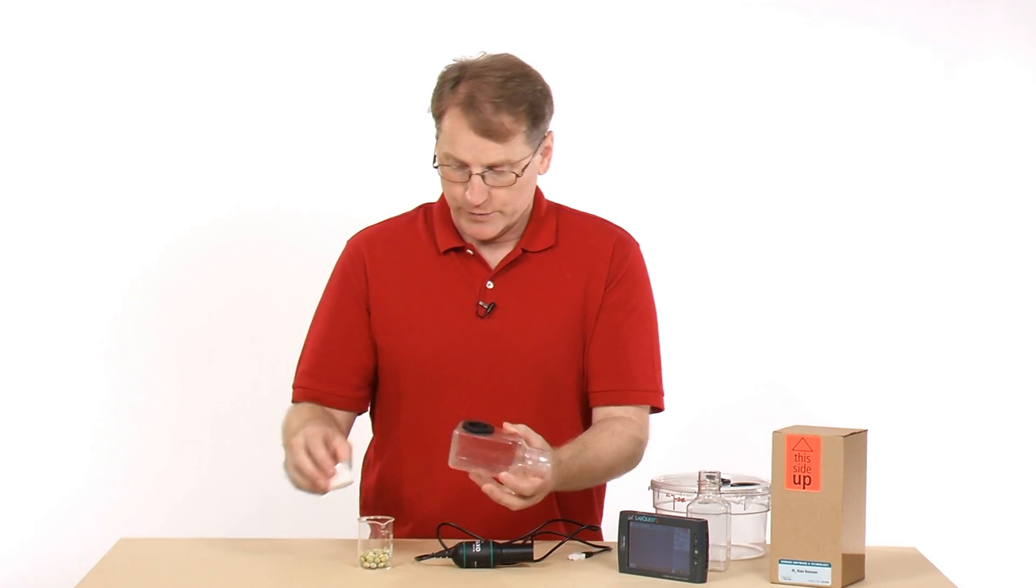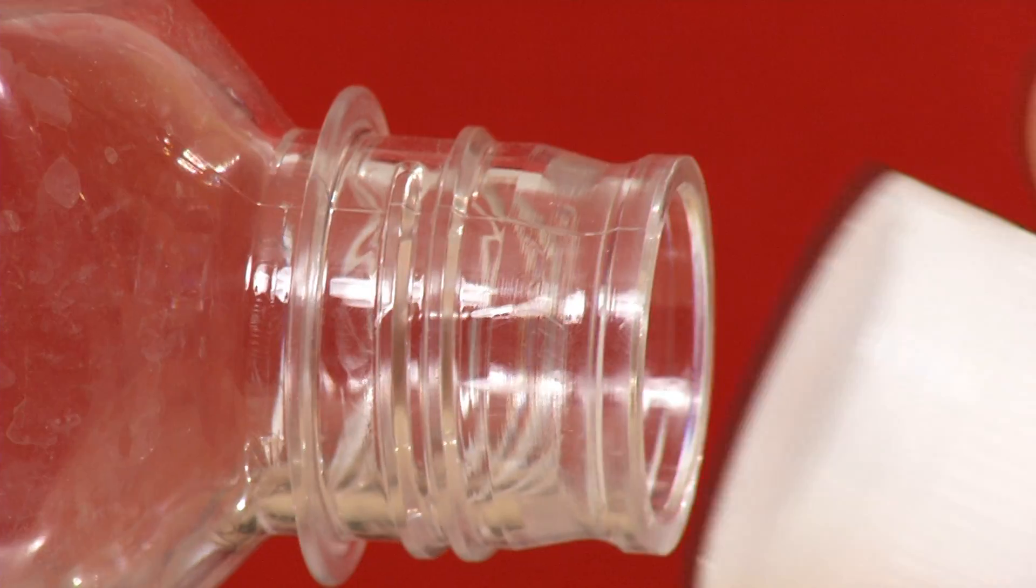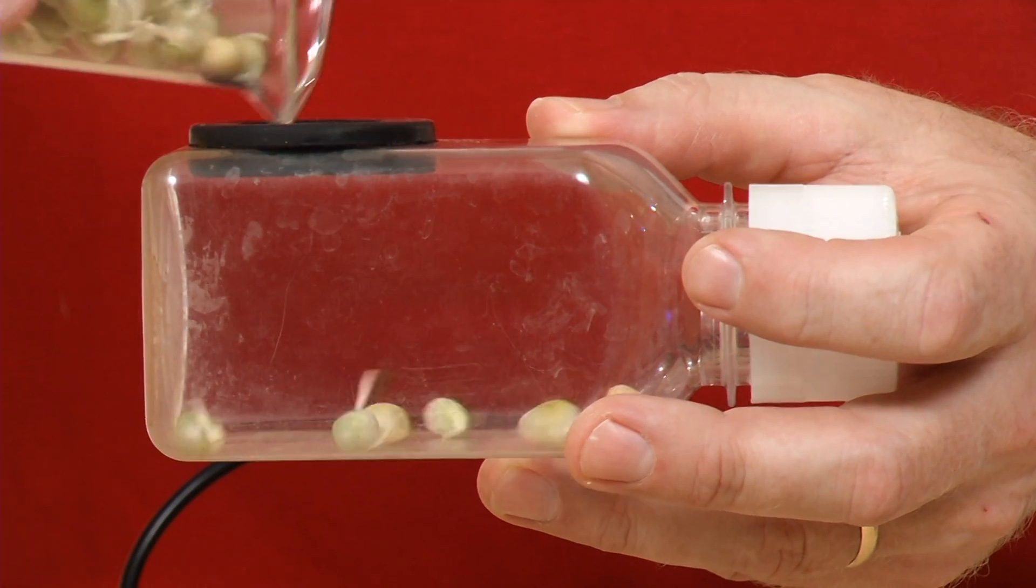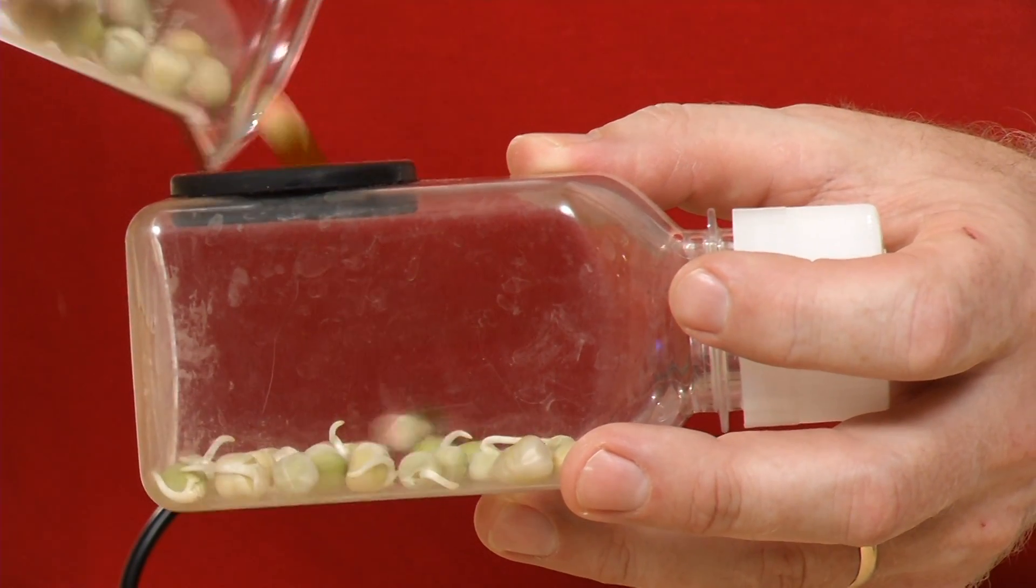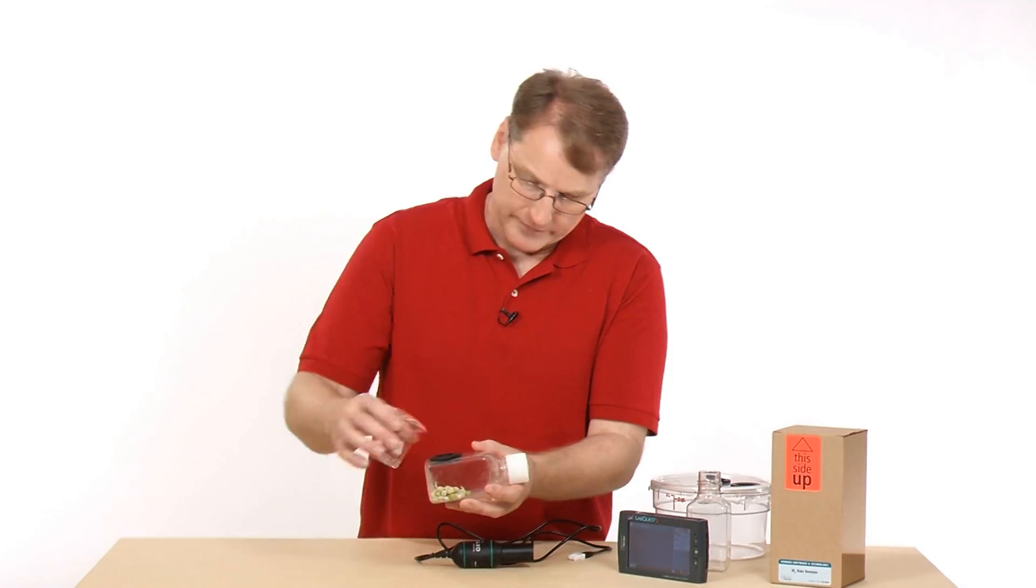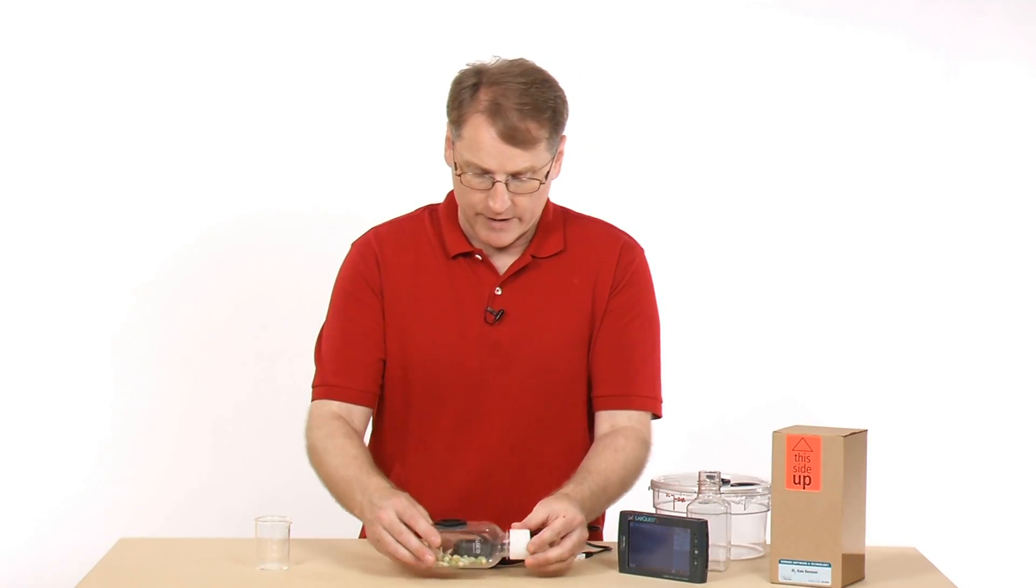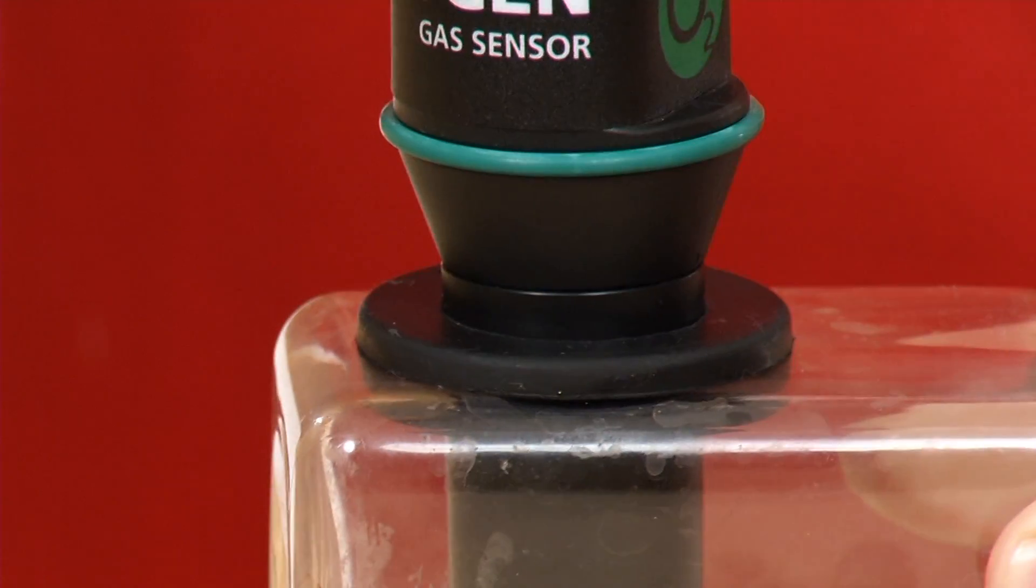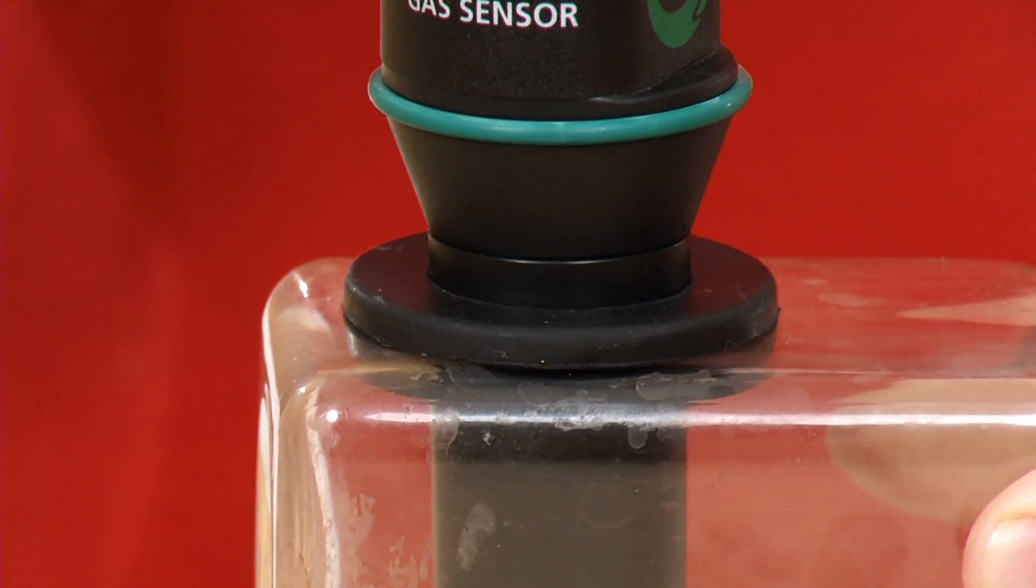So to do this, I'm going to put the lid on this one. And then I will put the peas inside the bottle. There we go. And I will put the oxygen sensor down into there, like that.